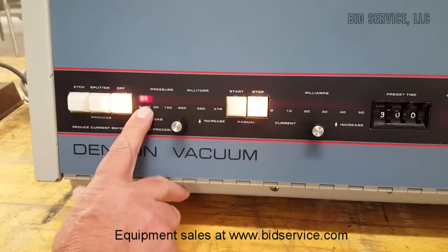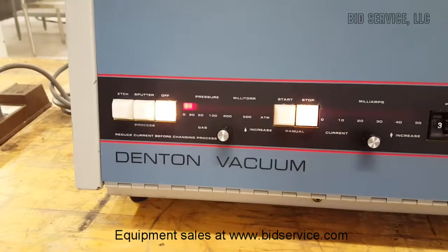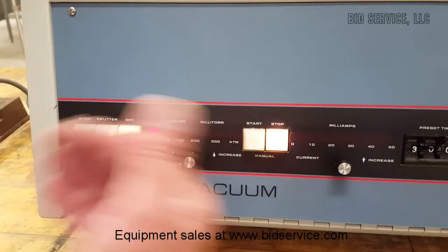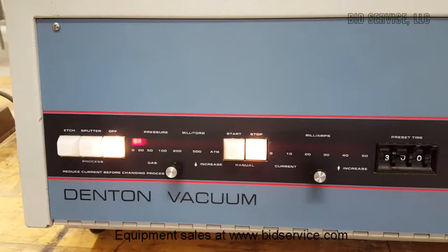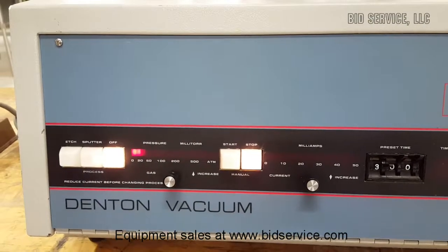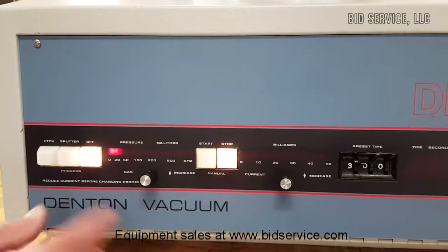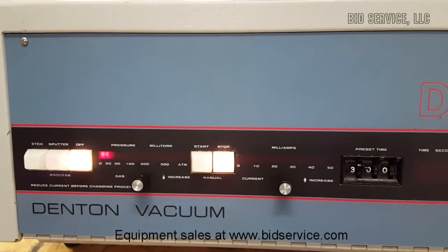We're going to let it pump all the way down to about 20 millitorr. You can see we're at about 20 millitorr now, so I'm going to push the etch button. I've got argon hooked up to the back, so argon will enter the chamber and the bar graph will go way up, and most likely kick back out so that the etch button will no longer be lit.